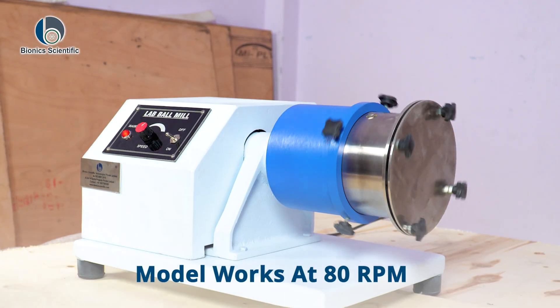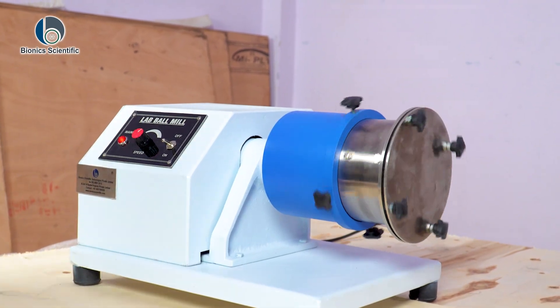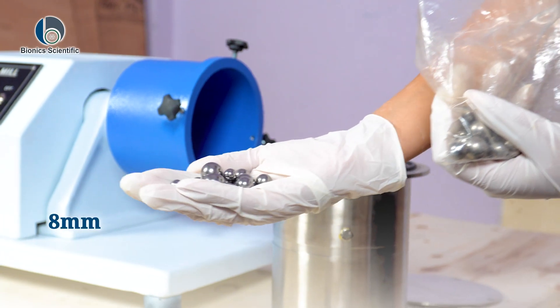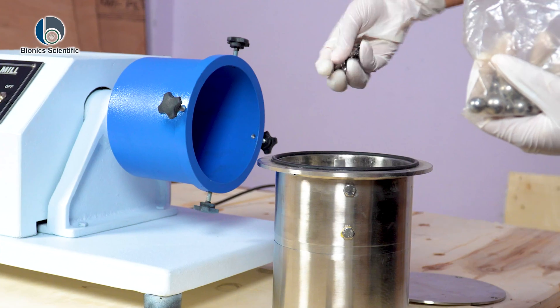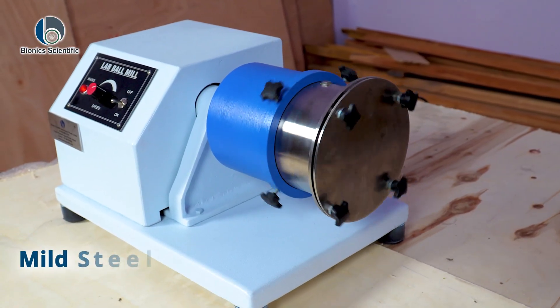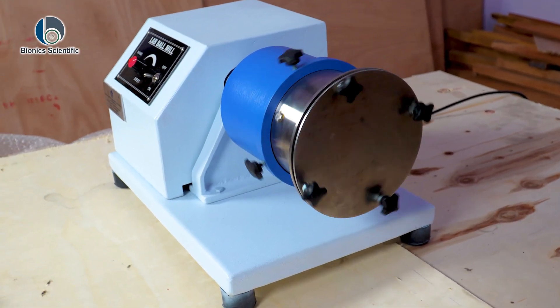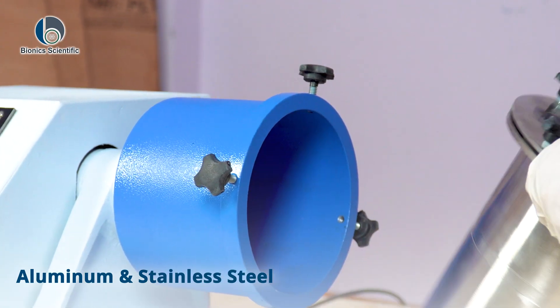This model works at 80 RPM, the ideal speed for effective grinding and mixing. We provide grinding balls in three different sizes — 8mm, 12mm, and 16mm — to suit various sample types and consistency levels. The body is made from durable mild steel for strength and stability, while the jar is built using a combination of aluminium and stainless steel.